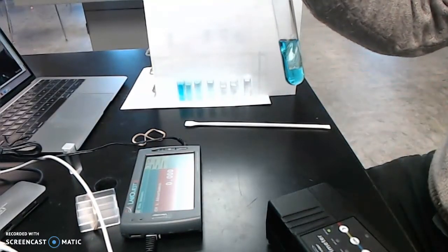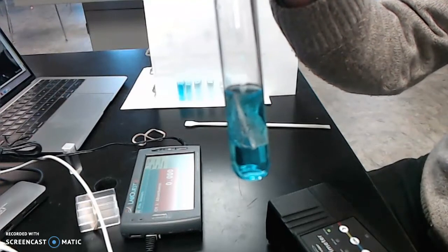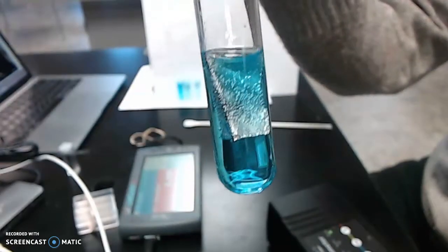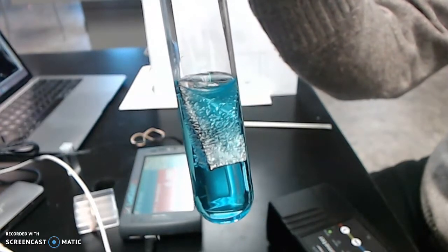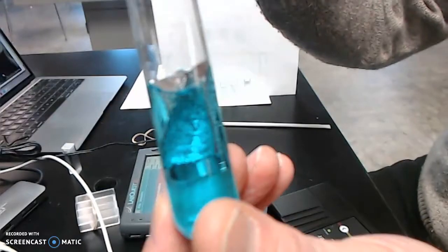But as you can see, perhaps, if I get close enough and we get a focus on the test tube. I am being thwarted in my efforts to get a focus. There we go. I'm not sure that you can see this, but there are bubbles forming on the surface of the aluminum. That side is coated, but this side I see some brown, especially on the margins. And then I see bubbles forming.